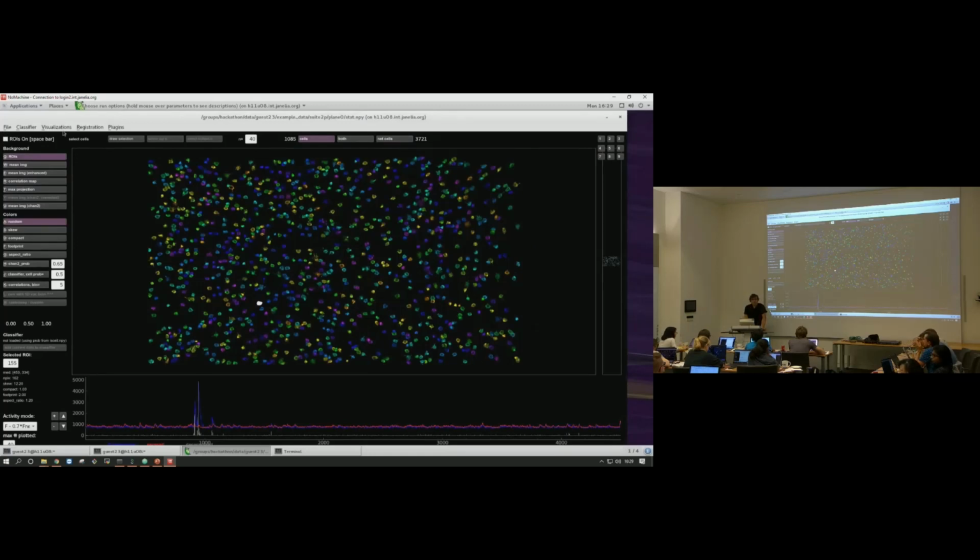Unless you want the MATLAB file. In that case, after you're done with manual curation, you can save the mat file here. And it will automatically recreate this Fall.mat file for you with the iscell that you want. Okay, so now we want to build a new classifier for this data set.